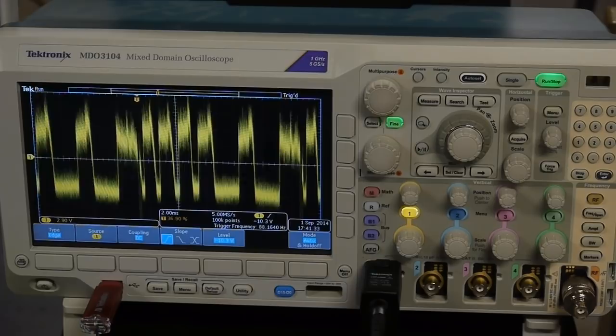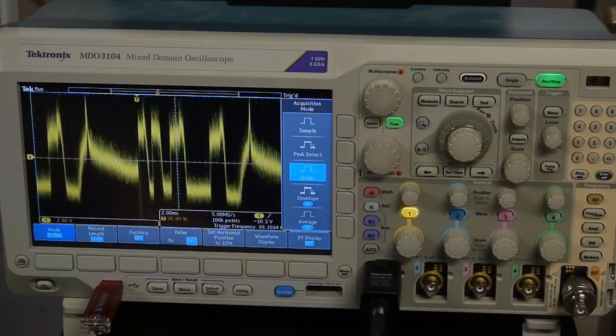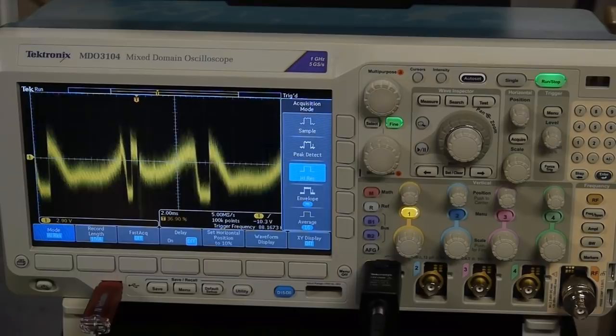Second, I'm going to go to the acquire menu and change the sampling mode to high resolution. Since we're going to be sampling at a relatively low rate, much slower than the scope can sample, we want to take all those values and average them together so that we don't get sampling noise.